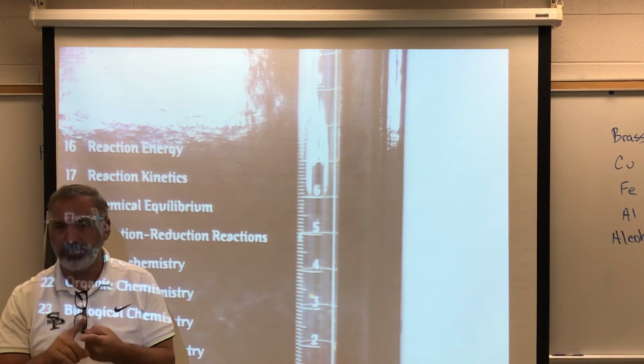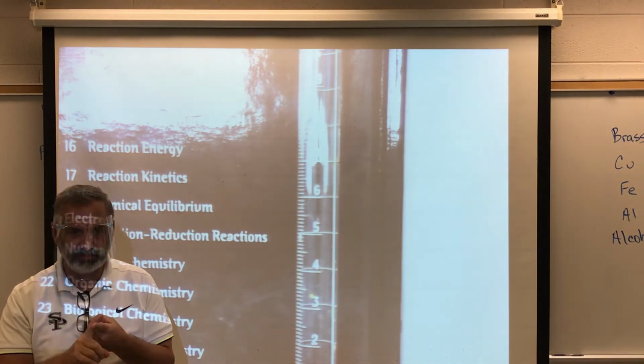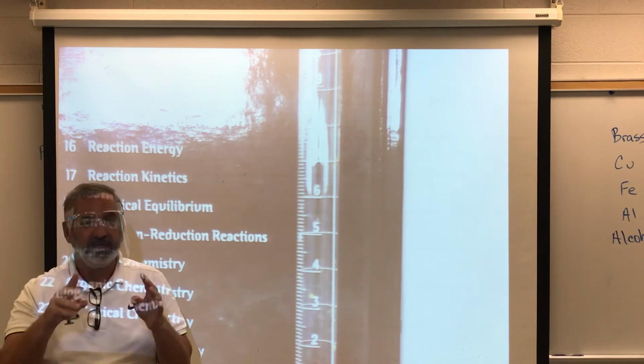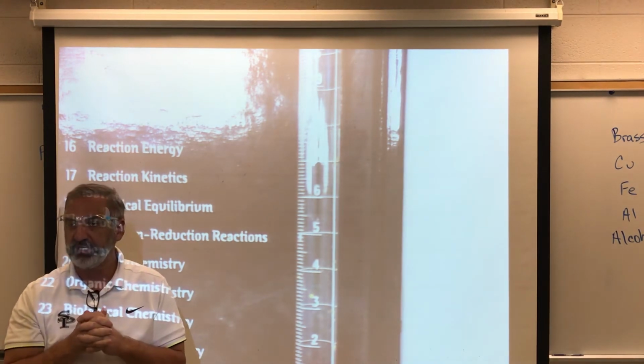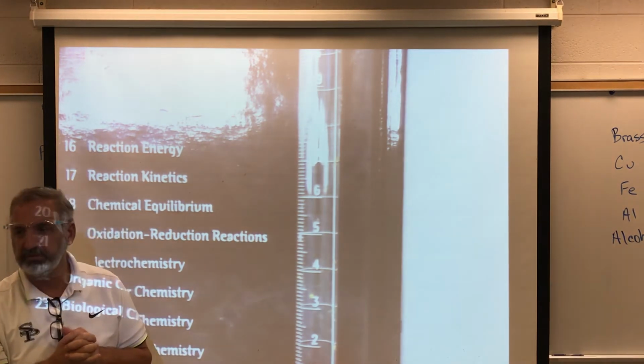Do not let it boil. Turn the heat off when it gets to 80 and keep stirring, and I'll come around and help you make sure that it all gets dissolved. But don't let it boil.